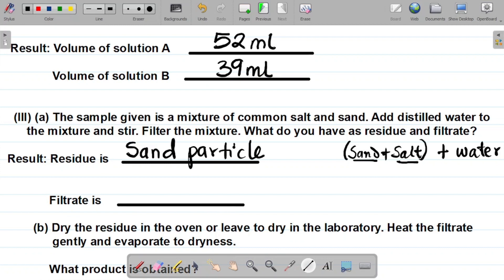The filtrate is not just water — it also contains salt, because the salt was completely dissolved in the water. Hence, what passes through the filter paper is salty water. So the filtrate is salty water.